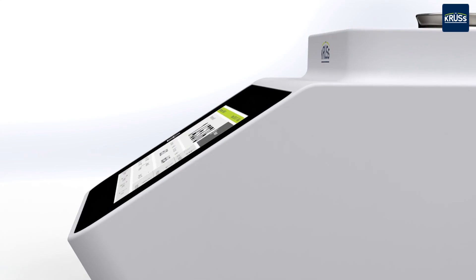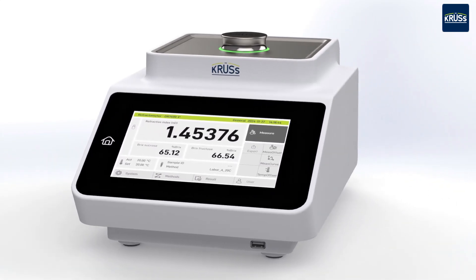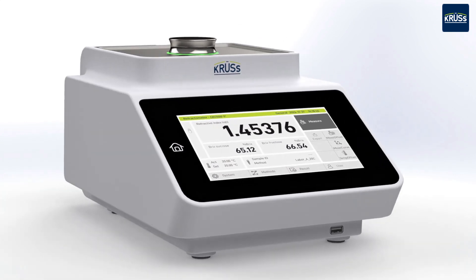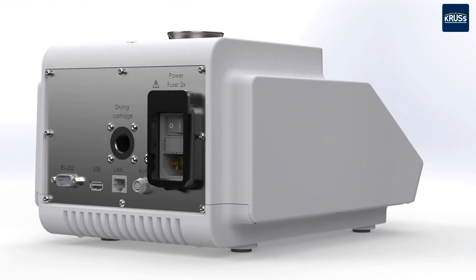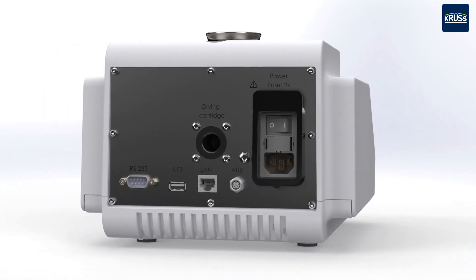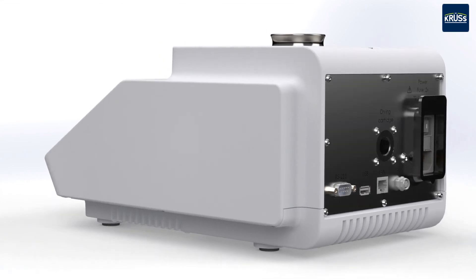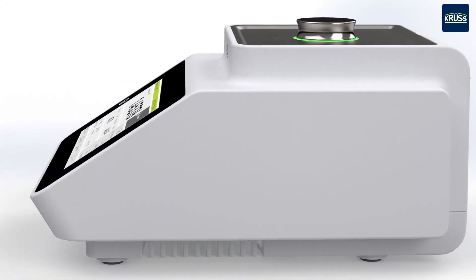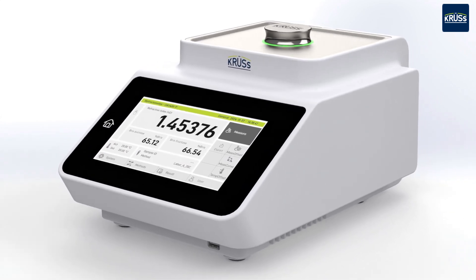With the modern KRÜSS laboratory refractometers of the DR7000 series, you can measure the refractive index and concentration of liquids and pastes with high accuracy in seconds. The DR7000 refractometers use precise internal Peltier temperature control to automatically temper samples to an accuracy of plus or minus 0.03 degrees Celsius.